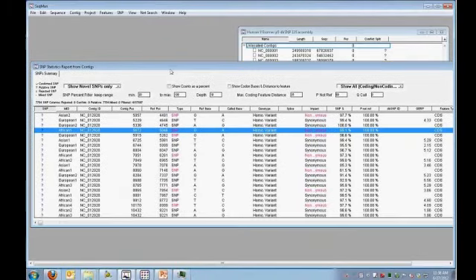And so we have a number of different columns in the SNP report, and this really becomes the analysis interface for a BAM file, large BAM file in our software. And so there's a number of different columns here, and I can explain what they are. And then also at the top of this table are the filters that we can apply. There's still some filtering that we'll need to do. We did a little bit of filtering at the assembler. There's more filtering that we need to do to separate noise from the signal that we're interested in.